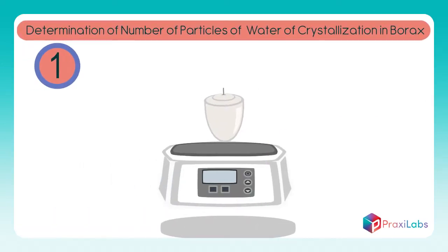Weigh an empty crucible, then record the weight. Weigh 1 gram of borax, then place it in the crucible.